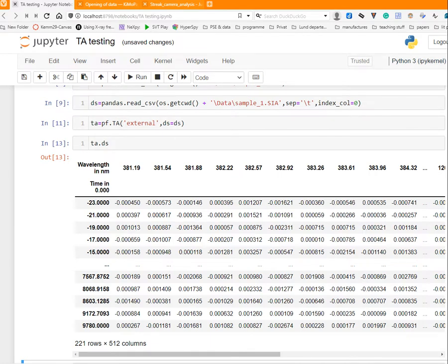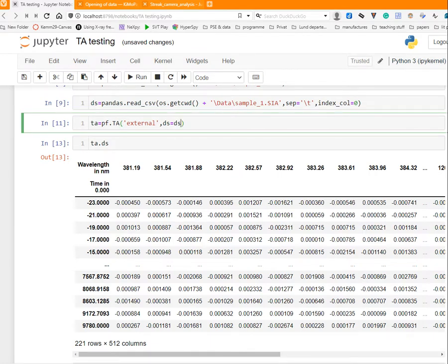As part of the import, you can give names. You can give, for example, the units as one of the options, and tell it what the units are on one of the axes. If you provide an external file, the column and row names will be automatically read and used if you don't provide them externally.